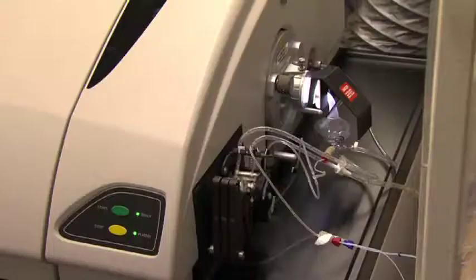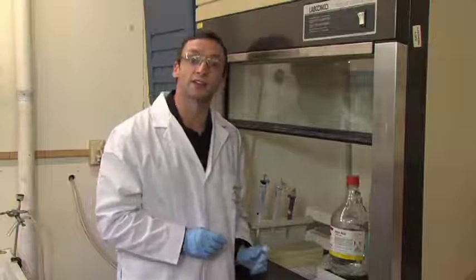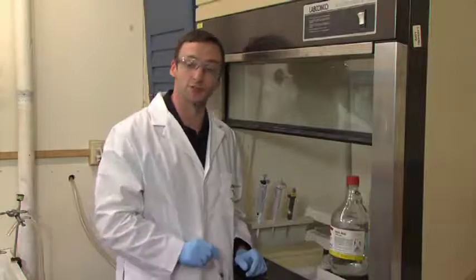The samples are introduced to the instrument via tubing and a peristaltic pump. Most laboratories use auto samplers for the sample introduction step. The instrument is calibrated using standards of known concentrations prior to sample analysis. The concentration of the analyte, in this case lead, is calculated from this calibration. The analyst prints out the calibration and sample results. This is referred to as raw data.